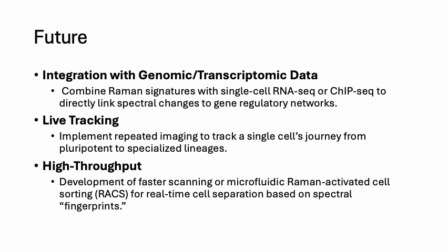Additionally, actual longitudinal tracking of individual ESCs could reveal fine-grained changes in real time. And if these enhancements do succeed, we could possibly have a powerful method for controlling and monitoring cellular differentiation in regenerative therapies.